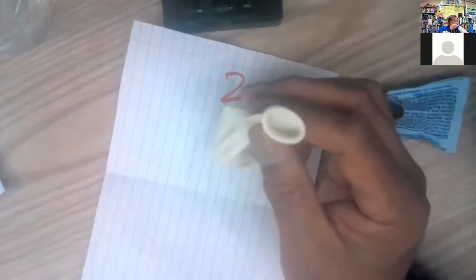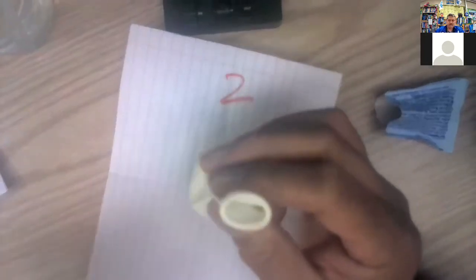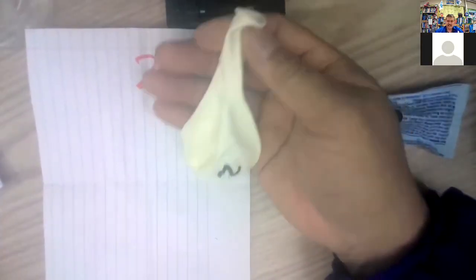Powder's in here. I just sucked it in. So there we go. That's balloon number 2. And put that one aside.